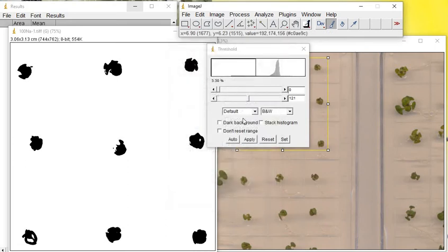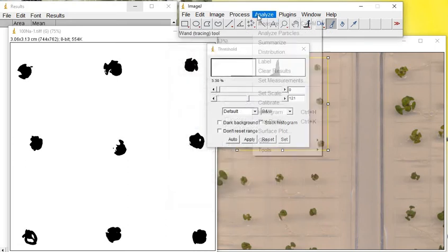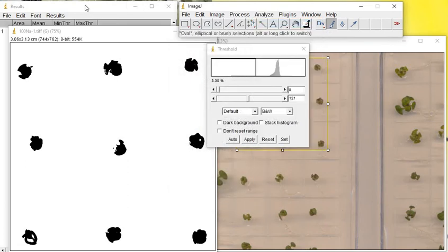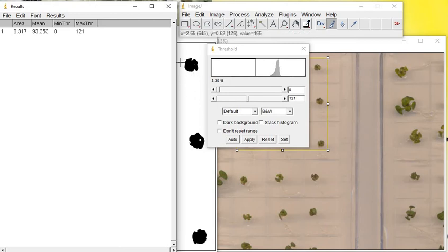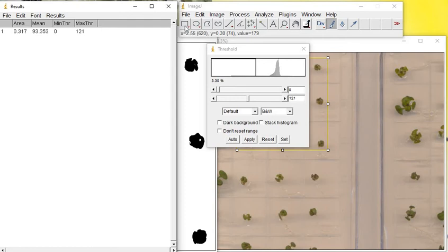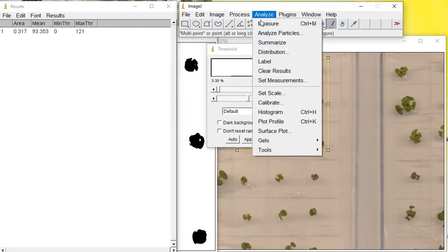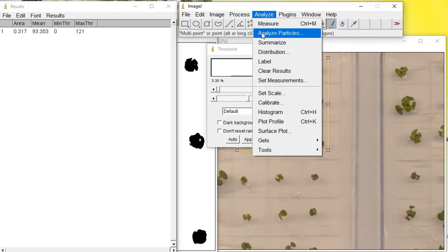Then if you use Measure, the area or the surface area of these plants will appear as this 0.317. Let's move on to this one - what will happen with this one.